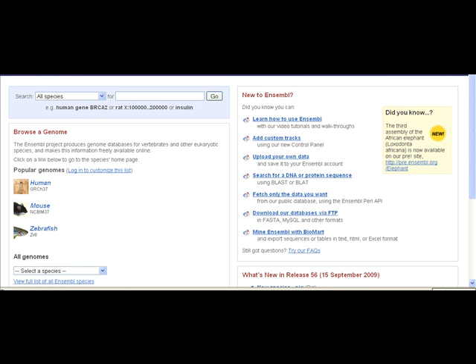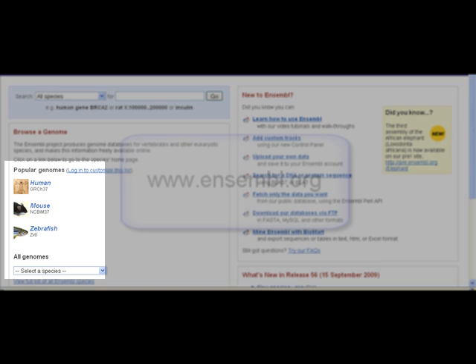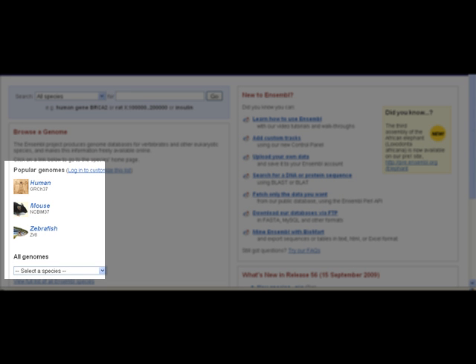Welcome to the Ensembl Genome Browser. The Ensembl project focuses on chordates and includes the genomes of over 50 species, including human, mouse, rat, and zebrafish — our most popular species.